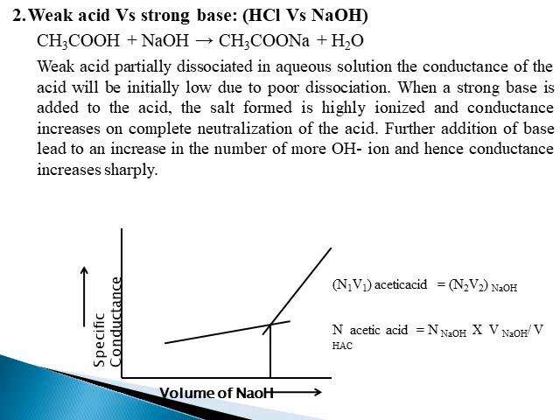You can see the first straight line corresponds to it. It is slowly increasing. It is not a steep or significant increase. It is an incremental increase, because the dissociation of acetic acid takes place in the solution, and hence you get an incremental increase of specific conductance.